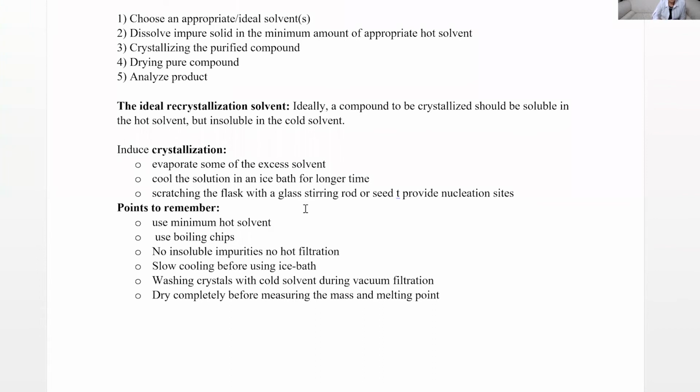When you scratch with the glass, the particles of the glass can act like a seed, so it provides the nucleation site for crystals to form, or when you add the seed, which is the pure sample, it also provides the nucleation site, and then crystals would form.